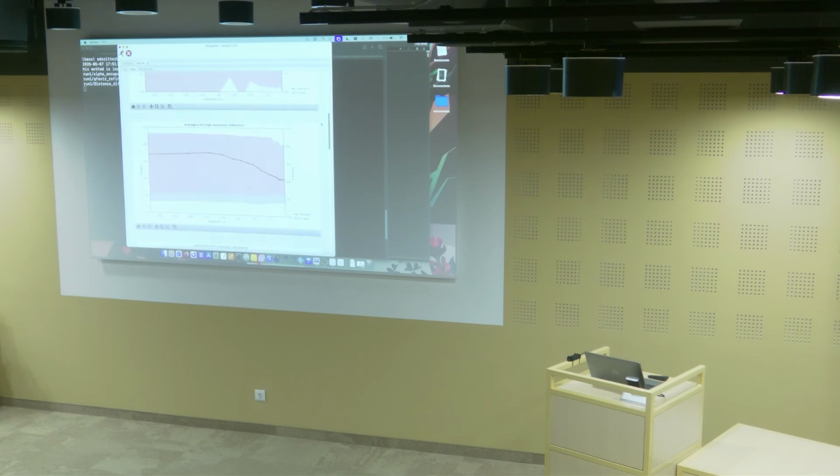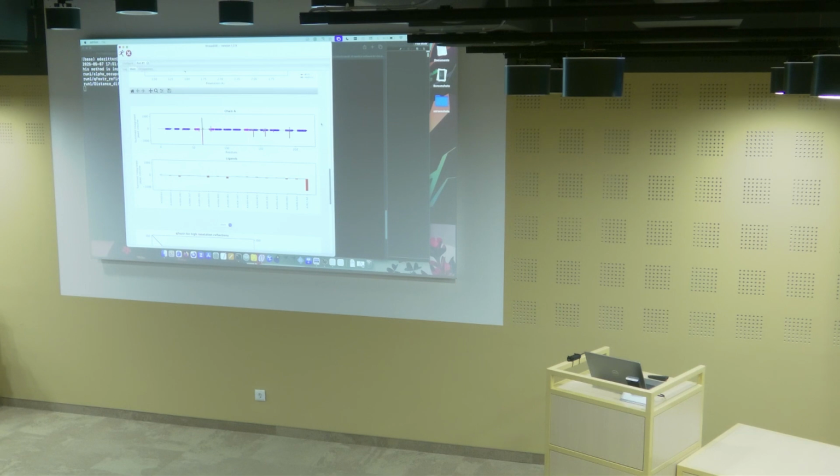Then we have some other plots. We're not going into a lot of detail. What we see here is a one-dimensional plot of your structure. Here we have just the amino acid chain, and in blue and pink we have the secondary structures. On top of that we have the integrated peaks that we could find in our Fourier difference map.